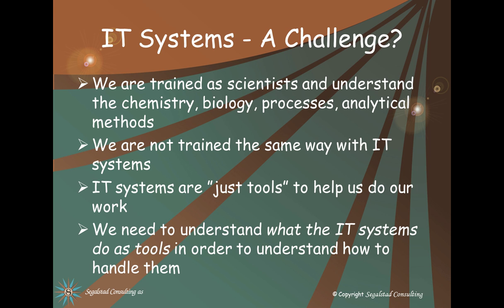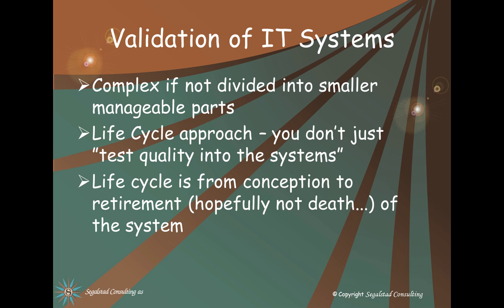Validation of the IT systems may be a challenge. We're trained as scientists and understand the chemistry, biology, processes, analytical methods, etc. that we work on a daily basis. We're not trained the same way with IT systems because the IT systems are just tools to help us do our work. We need to understand what the IT systems do in order to understand how to handle them. Fortunately, we don't really need to know anything about programming in order to do this.